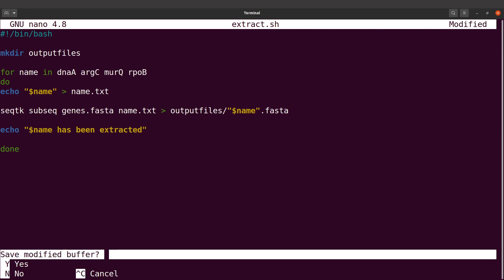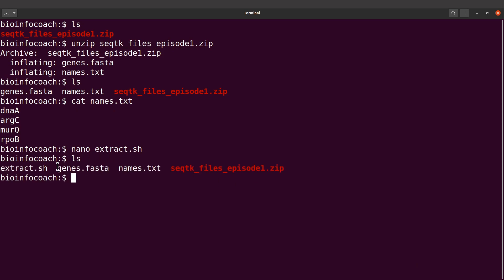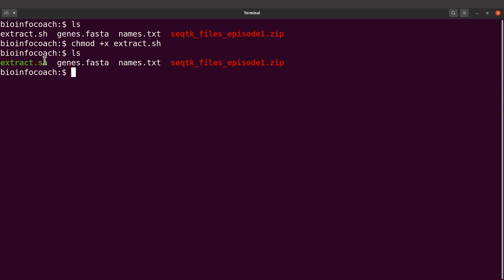Now if I do an ls, I'm going to find the script there. Because this is Linux, by default we are not allowed to execute it, so we have to add that permission. We'll say chmod plus x extract.sh. Depending on your platform, if you do an ls you may see that the color has changed — but don't worry if you haven't seen any color change, it's fine.